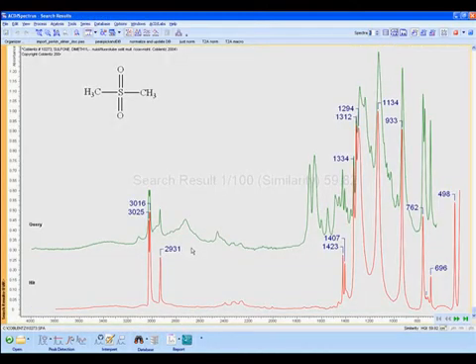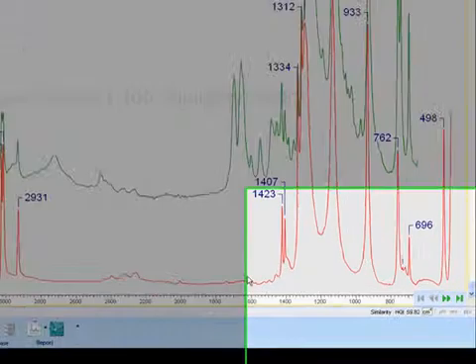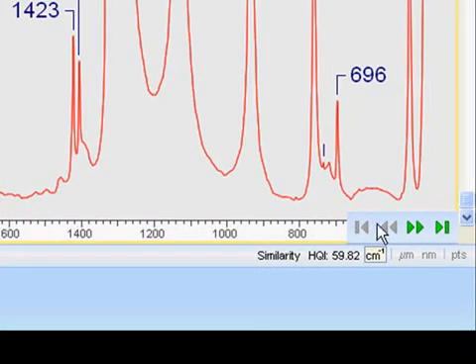The search returns with the first hit and the query spectrum in the overlay. Navigation buttons are at the bottom right of the screen.